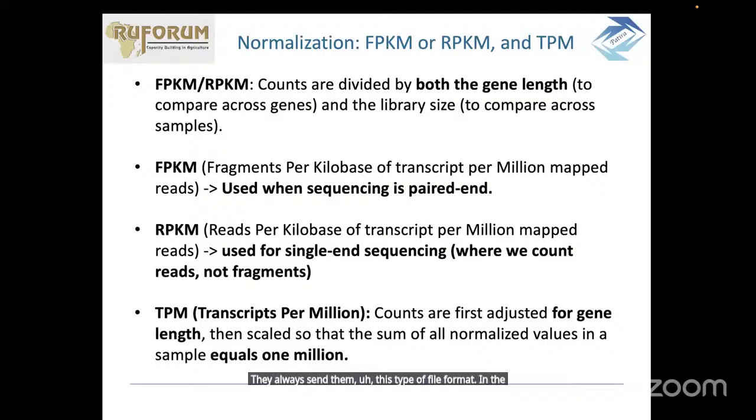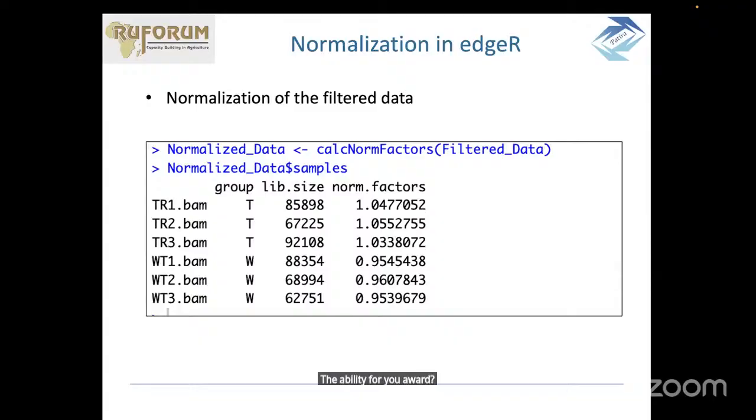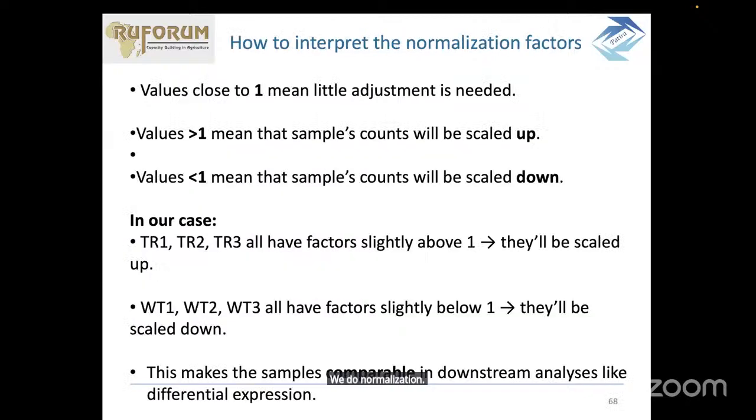And the last one is called transcripts per million. This is done by adjusting for the length so that the sum of all normalized genes is equal to 1 million. Okay. So when you have this, after normalization, then be ready for what? For doing your gene expression analysis. So after alignment, you do annotation, you do normalization, and then the last part is you do your gene expression.